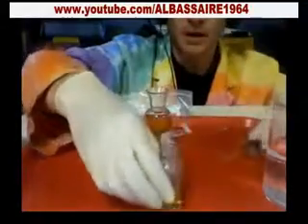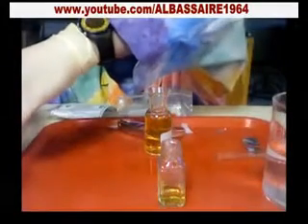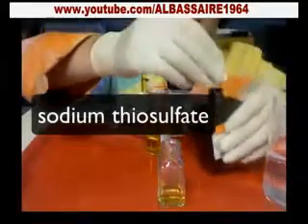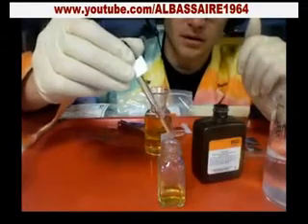Okay, now to actually do the titration part, what we have is this, which is yellow. Now we're simply going to start adding drops of the fourth chemical in the experiment. This is called sodium thiosulfate. It comes in a little dropper like this, and this is the titration portion. I'm going to take one drop of it and add it.